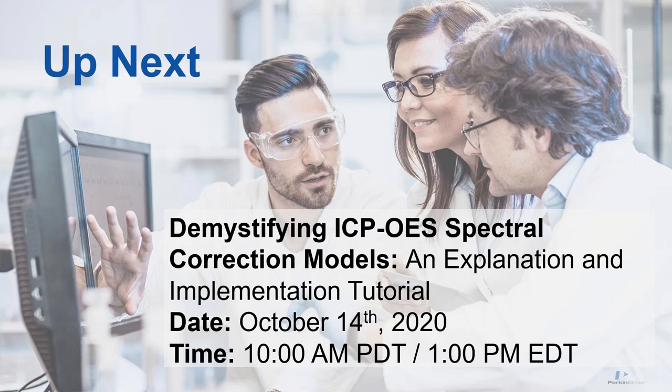The consistency of that depends on the T, on your tubing diameters, right? It'll depend on your matrices, what you're trying to dilute as well. That'll be a variable. And there are different T's out there, with different geometries, which make a difference. One option I've heard some people use, instead of pipetting the internal standard or adding it online with a T, is that if all the samples are being diluted the same amount, they'll add the internal standard to the diluent. So if every sample is going to be diluted 10x, the same amount of diluent will be added to each sample, so the same amount of internal standard will be added to each sample. That's another way of doing it, which gets around some of these problems.